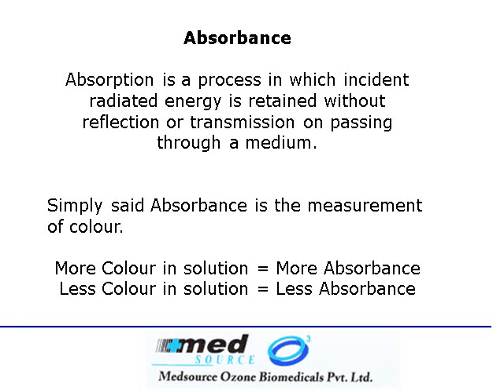Now, what is absorbance? Absorbance is nothing but the amount of color present in a sample. Rather than trying to understand the physics behind absorbance, I think it's more important that we understand that very simply said, more is the color in a solution, more is the absorbance. Less is the color in a solution, less is the absorbance.